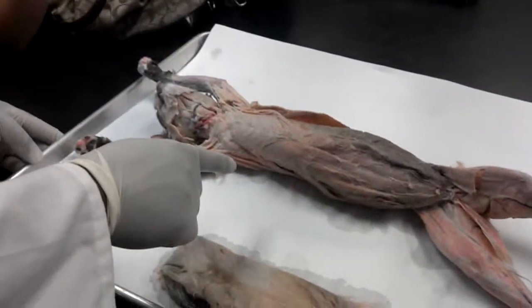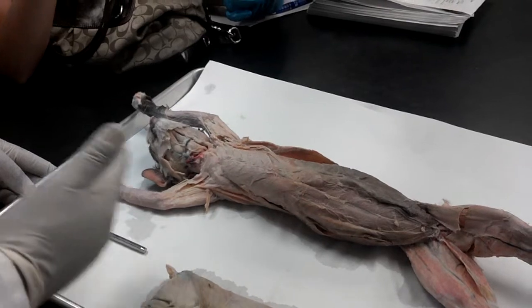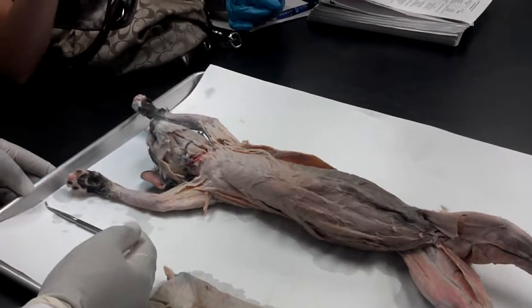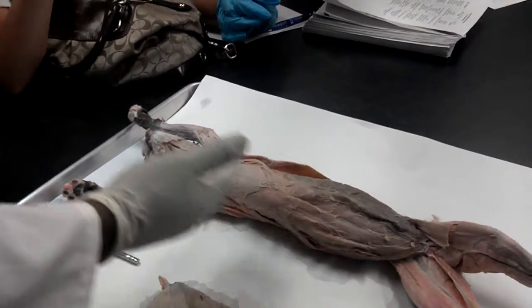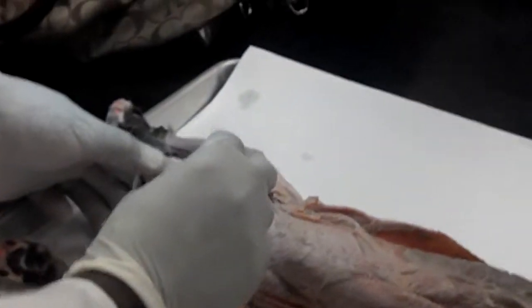The best way to go is to identify the superficial muscles. Once you finish, you go deep. Okay? So if you start with the front, from the head to the back legs, you're going to have this one. Okay? So this is the digastric muscle.